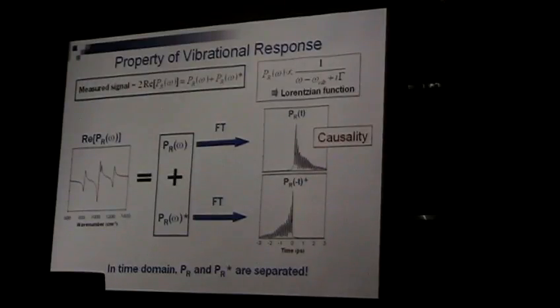This is nothing but the Kramers-Kronig relation. Imaginary part to real part, or real part to imaginary part. But here, I just found that there is a simpler, much faster way to do this in a computer, less than something like a microsecond. It's using Fourier transform. And actually, this is very interesting.